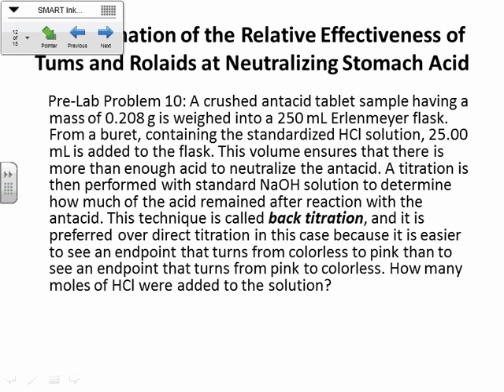So that's why what we want to do here is we basically go too far, right? So we have a base. The antacid tablet is a base, okay? And it's sitting at the bottom here. And you add a bunch of acid into that base, so much that you've completely neutralized the base, and now you have extra acid, okay? Now, after we add too much acid, then we can add in a certain amount of base and figure out how much extra of the acid that we had, okay?